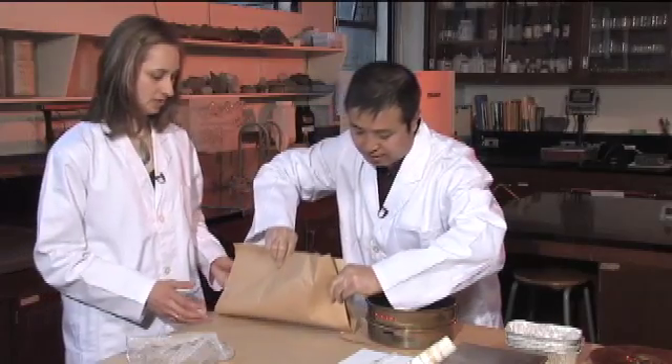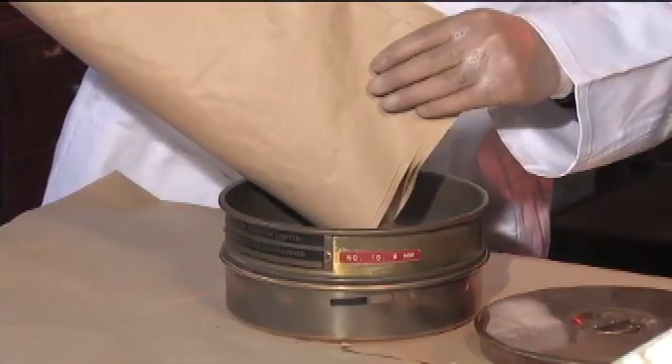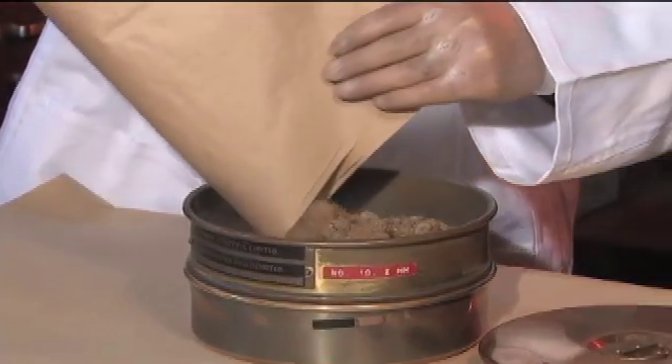So I guess we just pour the whole sample right into the top? Yes, slowly and carefully — because it's dry you don't want to make dust, so do it gently. We want to keep the whole sample that we took out of the hole.